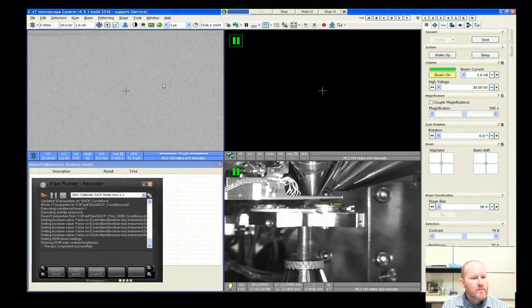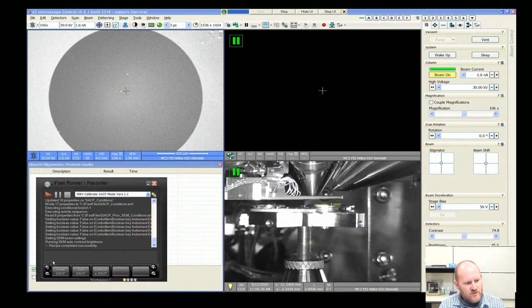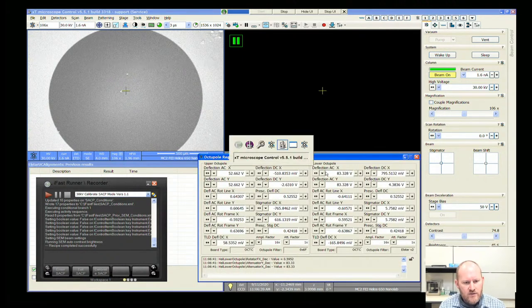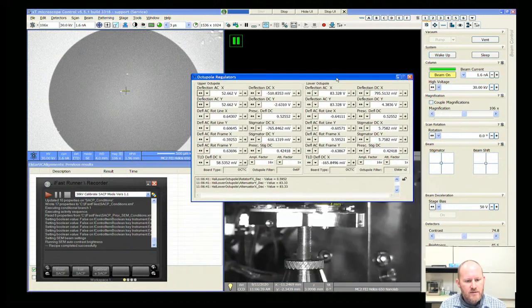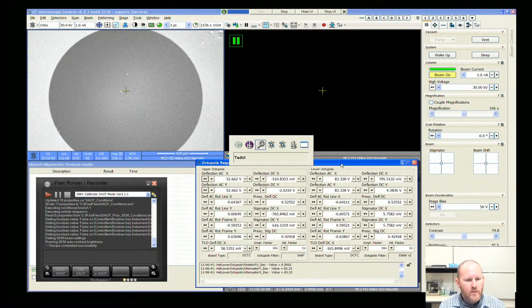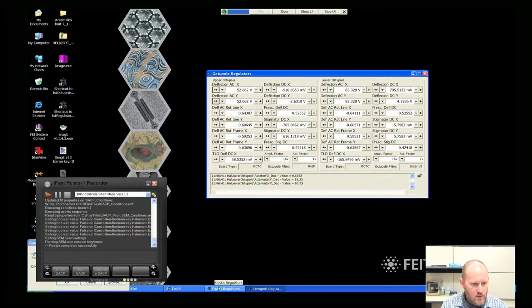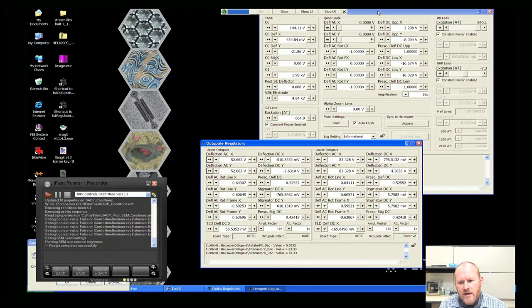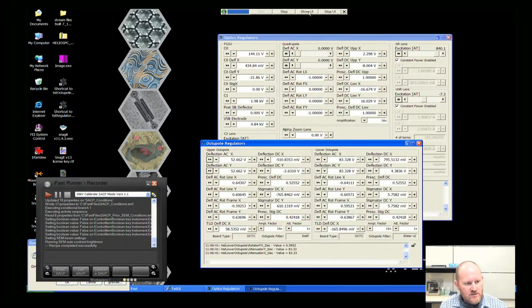A couple pieces of software that you'll see: we have our iFast runner which has the scripts for entering and exiting SACP mode. When I go to build the voltage dependencies I'm going to use the octopole regulators and the optics regulators. If you've ever used the Thermo or FEI TEMs and free lens control, that's effectively what we're going to do to build these voltage dependencies.